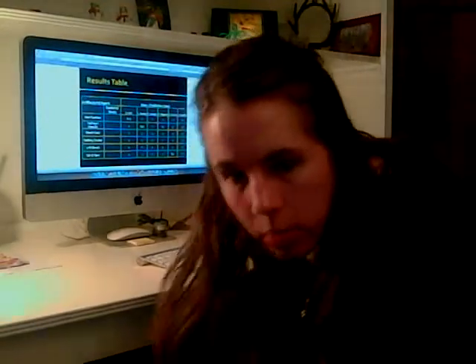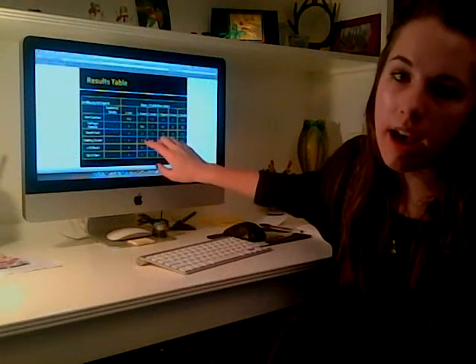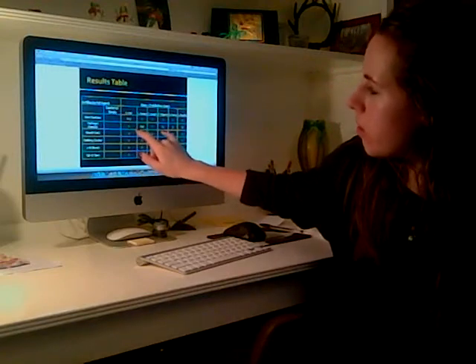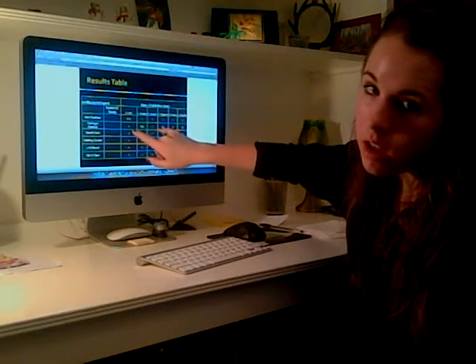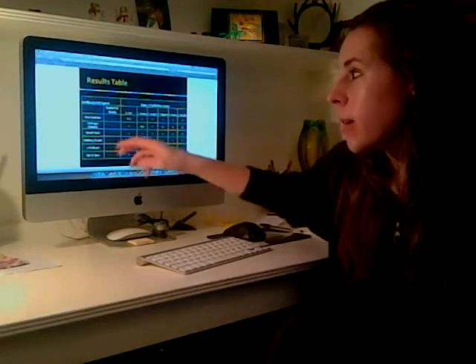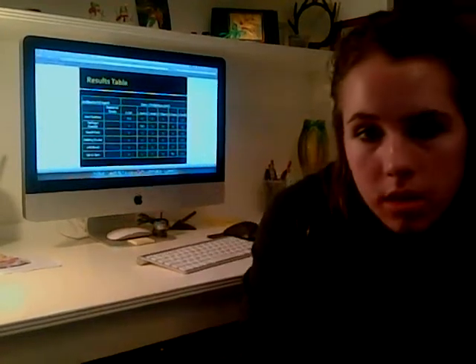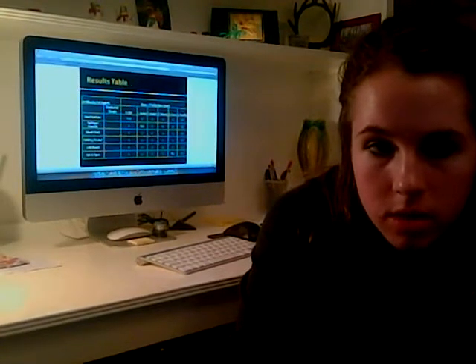As for the results, right away you can see that mouthwash and rubbing alcohol had 0s across the board for their zone of inhibition. You can also see that hydrogen peroxide was quite the opposite and had much larger zones of inhibition. 10% bleach, spick and span, and hand sanitizer were less clear and had more varied results.